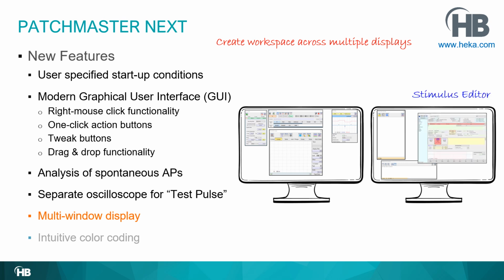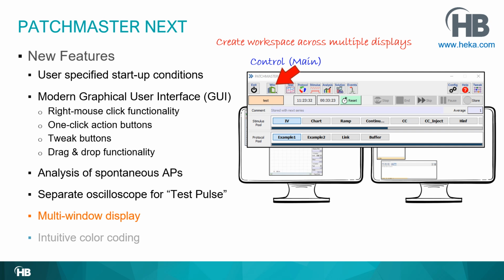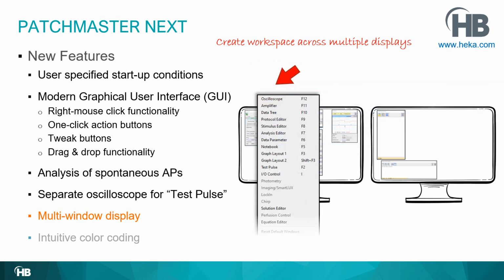Then Stimulus Editor, depending on where you open it, the program will remember where you opened the Stimulus Editor, the size of the window, things like this. The same is true, of course, for Analysis Editor and also for a Protocol Editor. In addition, you can, of course, add further windows that are usually not being displayed. For example, when you press on this button, it opens up the Windows display for other windows to be opened.